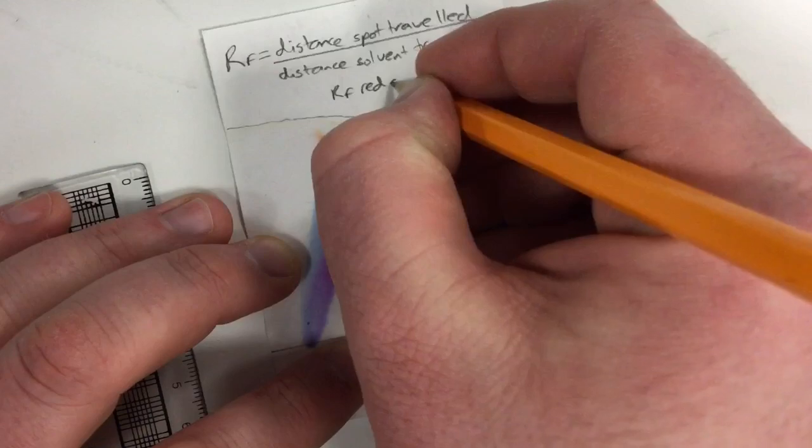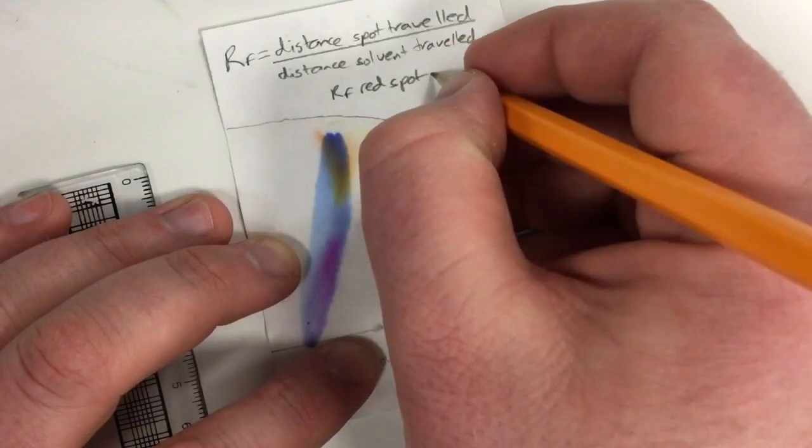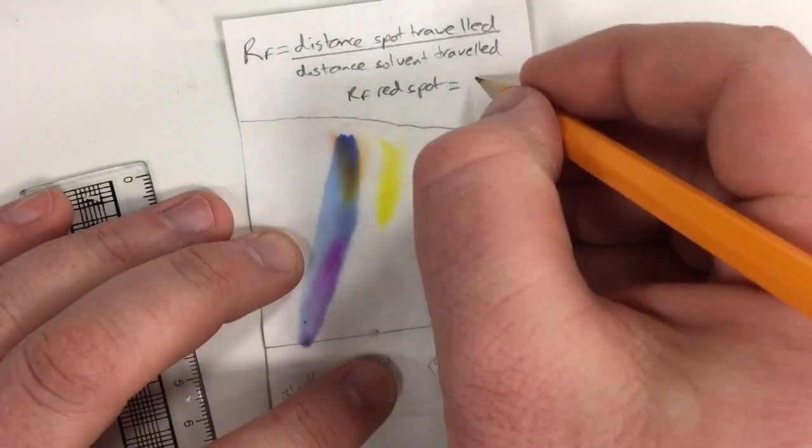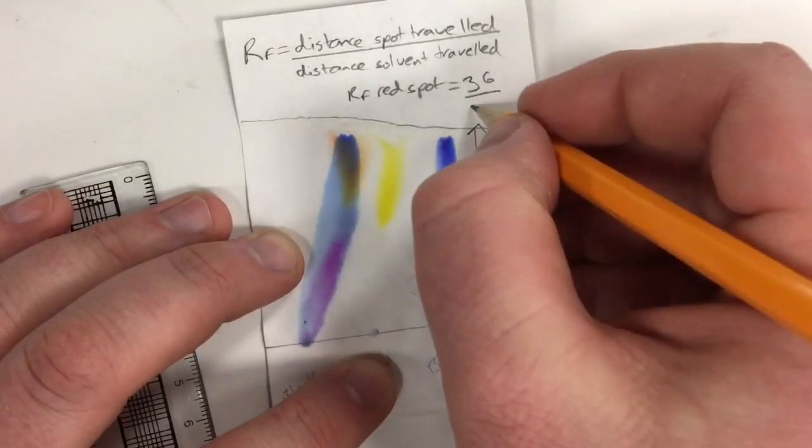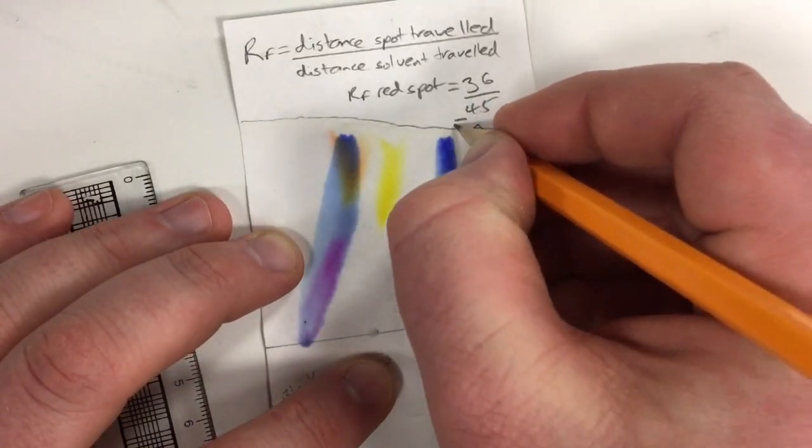With our values determined these can then be used to calculate the RF value for a particular spot. These can then be compared against a reference spot or other spots in the chromatogram sample.